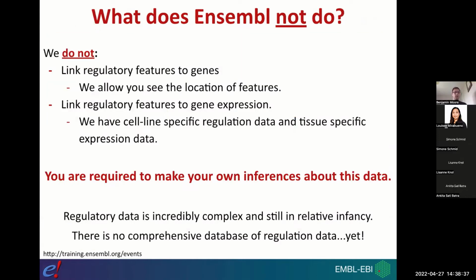So one of the questions that I received yesterday in the chat box in the course was someone who was asking to look at the promoter and enhancer, so regulatory features for a specific gene. So it's important to remember when you're using Ensembl that we do not link regulatory features to genes. So we have the genome assembly, we have our gene build, so the annotation of genes, and we have our regulatory build, the annotation of regulatory features. And you can see them side by side.